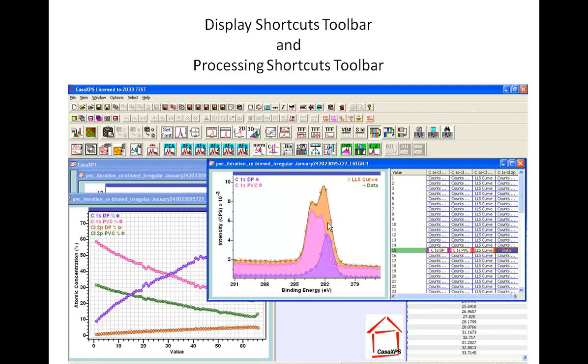into a pair of component curves which represent different chemical states of the sample over the course of this measurement. A linear least squares analysis based on these component curves provides a means of creating a profile showing how the trends change from the initial material to the final material over the course of the experiment. Finally, I will attempt to place into the context of chemistry the mathematically determined shapes from the analysis. In particular, we have one that represents polyvinyl chloride and the other represents the material after chlorine has been lost from the polymer.